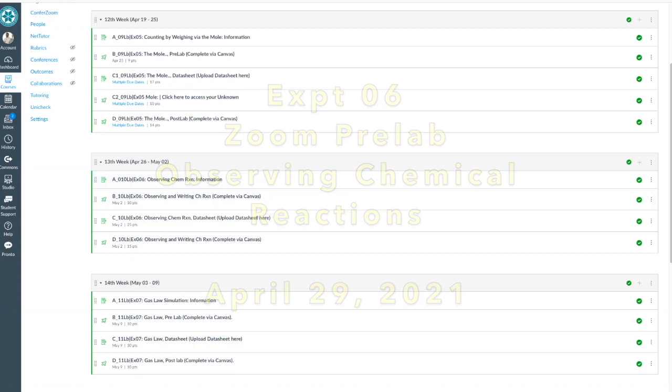So today what I would like to do is just go over the lab and then give a little demo of each of the experiments so that you can see how it's done. And if you don't have the material, I will show you what material to use so you can identify it in your lab packet. Or if it's not there, and I think you might not have the ethanol there, but you have some ethanol in your alcohol burner, so you can use that. Or if you have a hand sanitizer, you can use that too.